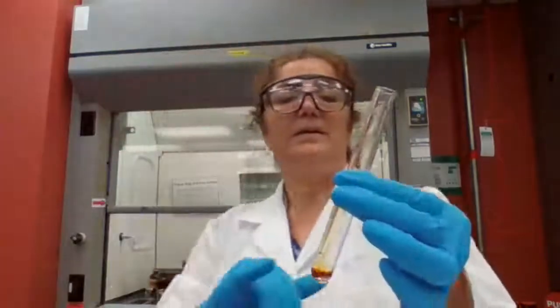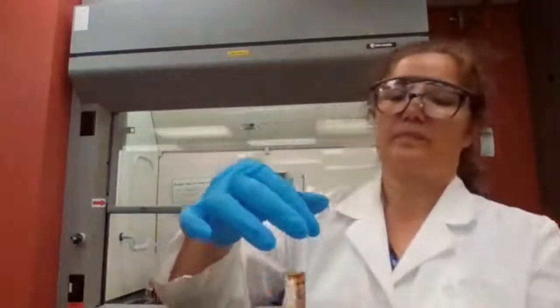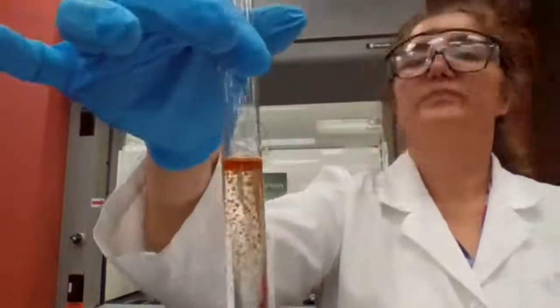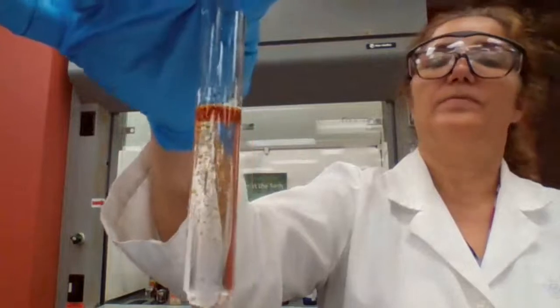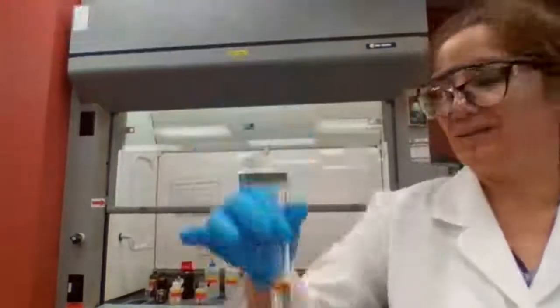Methylaniline, methylaniline, and water. What do you see? Dissolved or not? No. Methylaniline with water did not dissolve.